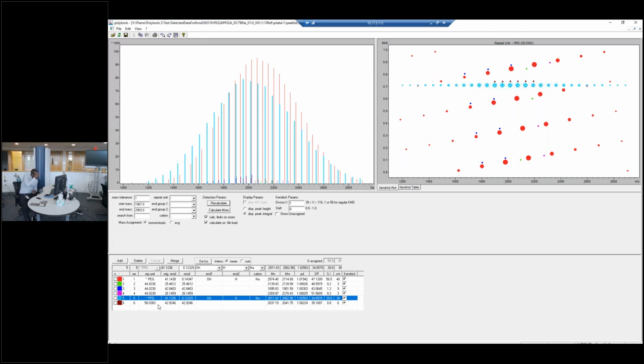For insoluble samples, how do you apply the sample to the plate without scratching up the MALDI plate? The scratching will affect the performance of the plate since it will no longer be a smooth flat surface. Can you comment on this?